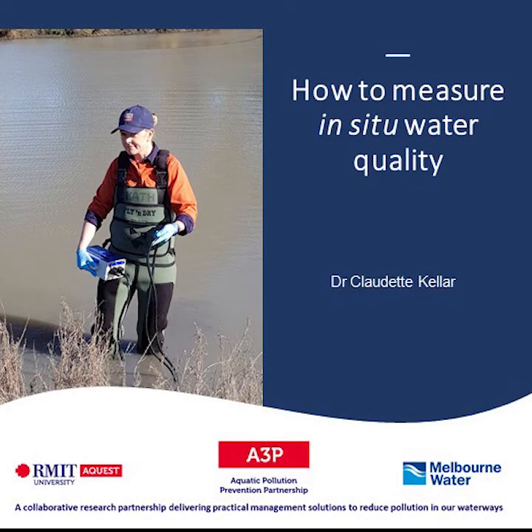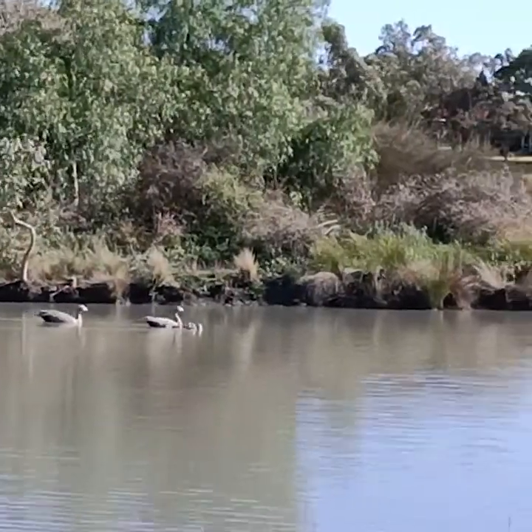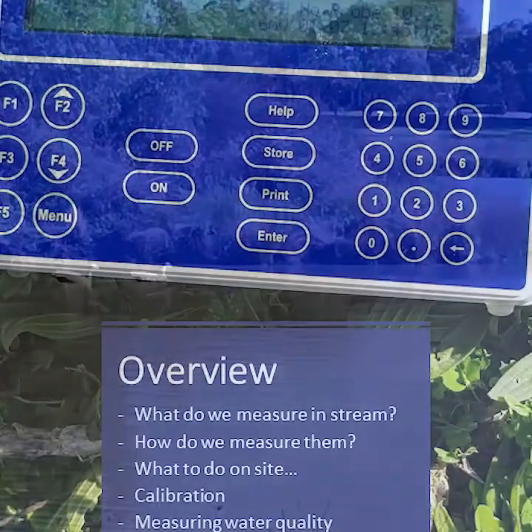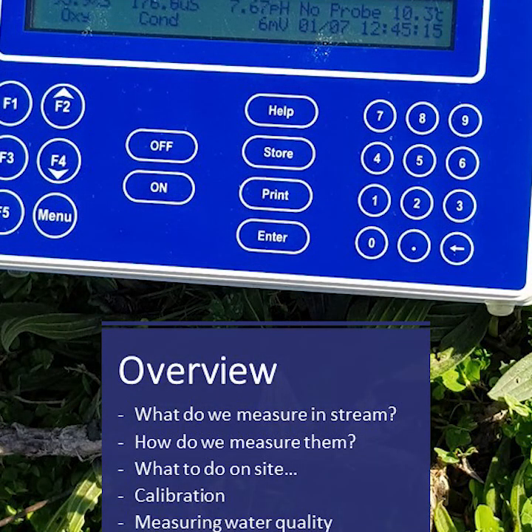This is a short video that is going to explain how to measure in situ water quality. So the video will cover what water quality we can actually measure in stream, what we use to measure the water quality, what actually happens on site, some information about the calibration of the meters, and finally, how we can actually measure water quality.